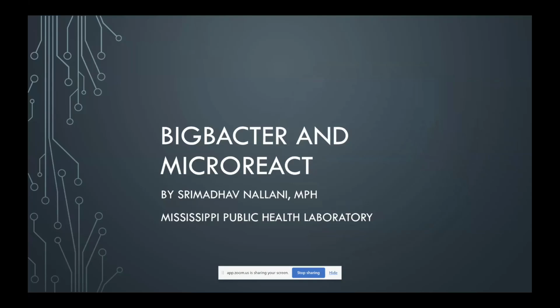I'm an epidemiologist with the Mississippi Public Health Lab. I'm going to be talking to you about two pieces of software today, which are really useful, in my opinion, for genomic surveillance. The first is BigBacter, and the second is MicroReact. I think these are both very useful, and they work in tandem really well. So I'm going to start with BigBacter and then kind of move into MicroReact.